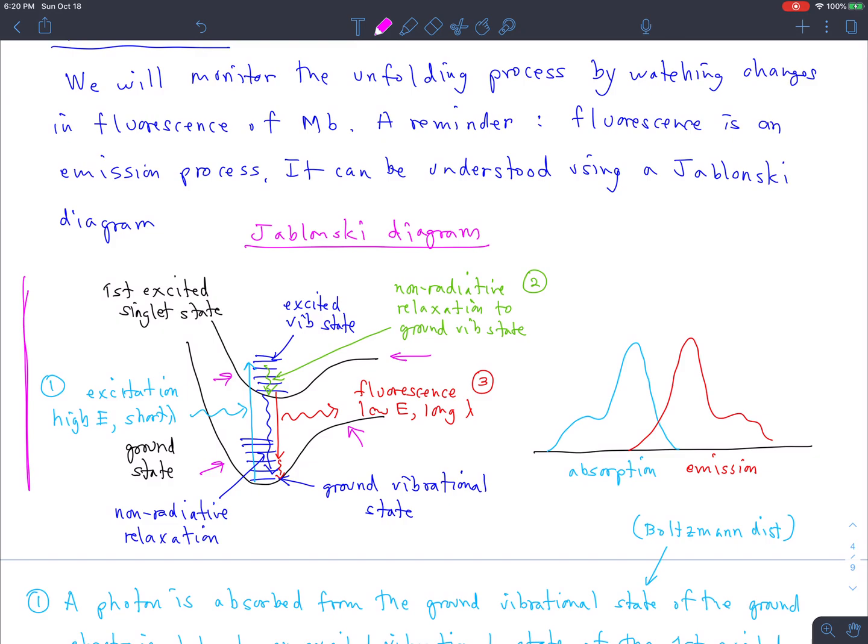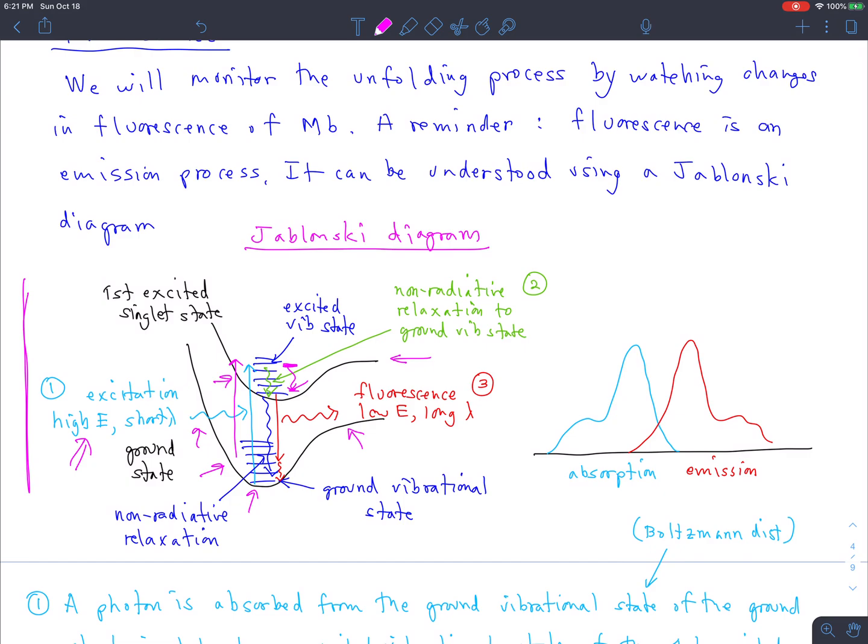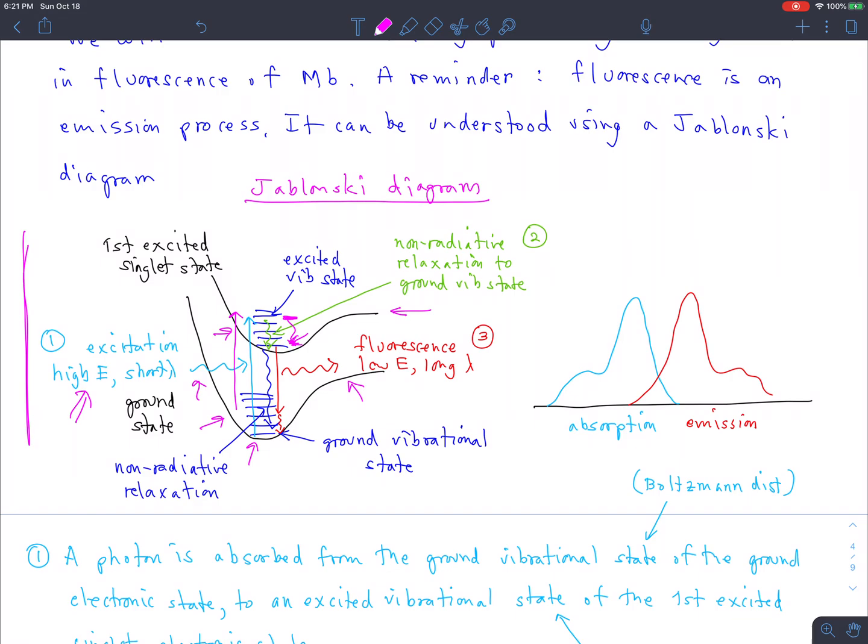And what happens is, usually you're in the ground state vibrational state. You send in a photon, a high energy photon, a blue photon, as I've drawn it here. And that causes an electronic transition from the ground state up to the first excited electronic state. But it usually doesn't go to the ground vibrational state, which means that it's got some extra vibrational energy after the transition. And that very quickly decays down. Basically, all that extra vibrational energy gets put out as heat into the surroundings, into the molecules around the absorber. And you end up in the ground vibrational state, even if you didn't go there originally. But that means that you've lost some energy to the surroundings already.